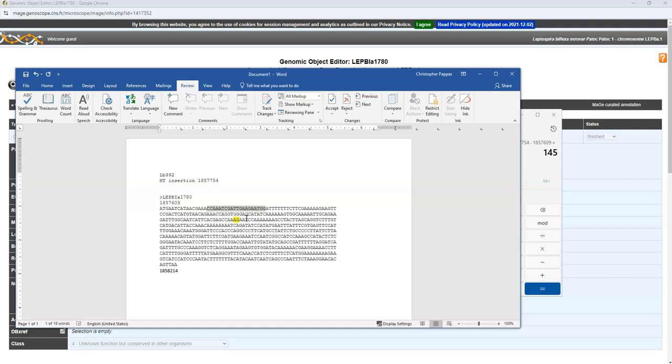If you do more than 25, what's going to happen is, with every nucleotide you add on, the melting temperature of the primer is going to get higher. So it's going to bind so well to the genome, you're going to have to use more temperature to break it off. So you could really create a good bond by using more nucleotides, but the more nucleotides you add on, the higher the cost of your primer. So I try to stick between 18 and 24 base pairs. That's a good number, at least in my lab. It works really, really well. You're going to get a good binding. You're going to get strong PCR results.